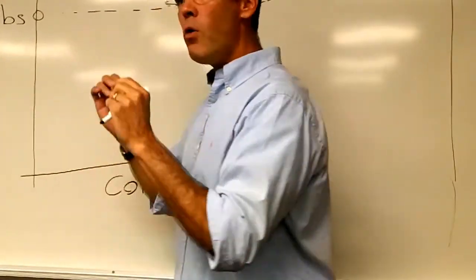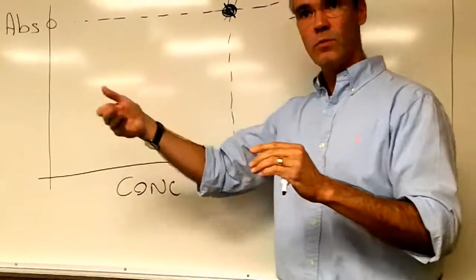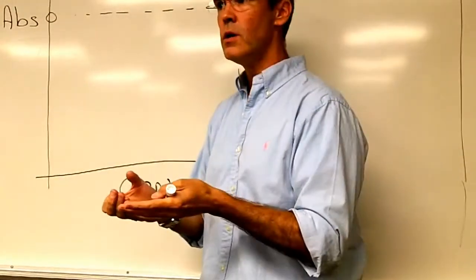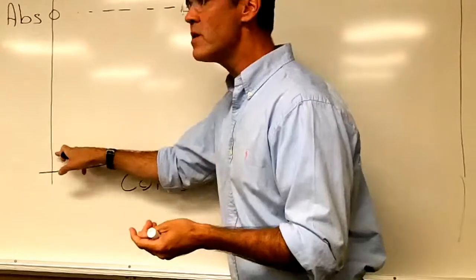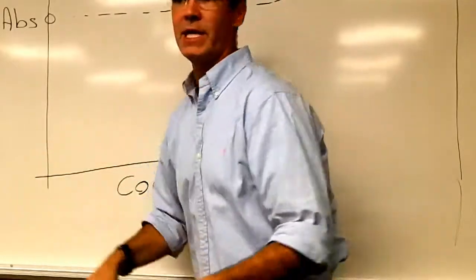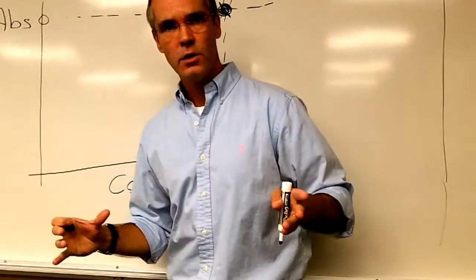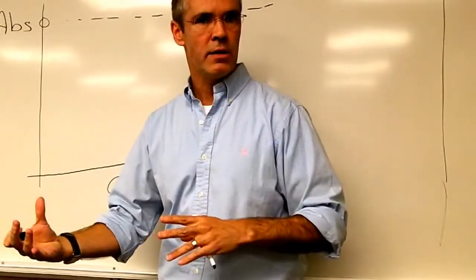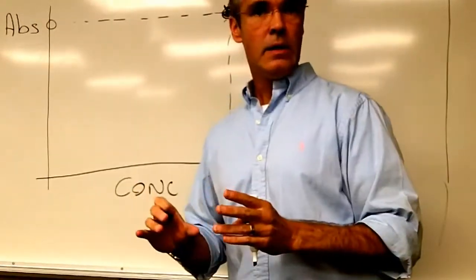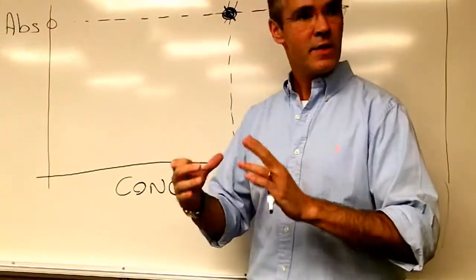Okay? The most challenging thing whenever you're doing this type of graph in order to guess or to calculate what concentration we have in the unknown is to set a series of points, okay? More than two, because of course between 2 points there's always a straight line, okay? More than 3, ideally, in a perfect world, you would have 8, 9, 10 points. When you are in a time crunch lab, right? You're trying to go as fast as you can, but do it the right way. 5, 6 points will be good.